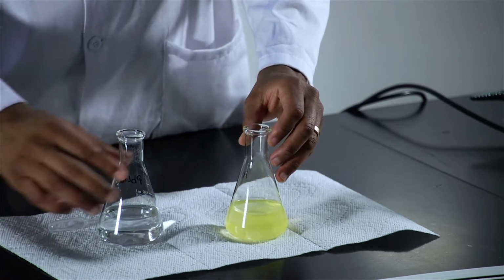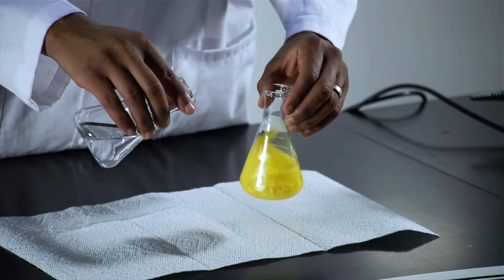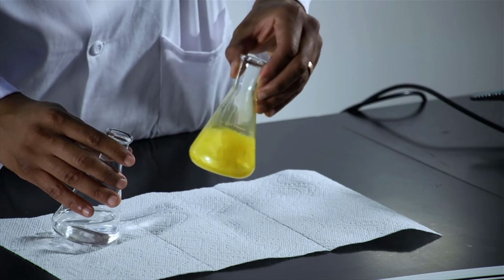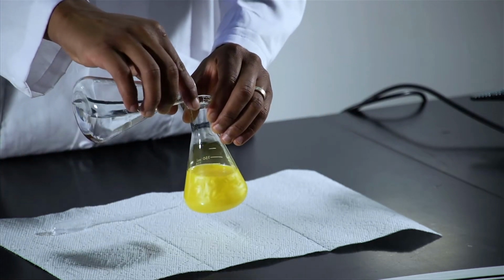Once you add enough drops there, you can actually dump the remaining solution and mix them together, and you start to see a nice slushy slurry of compound inside of the solution. So you can see that nice golden compound there.